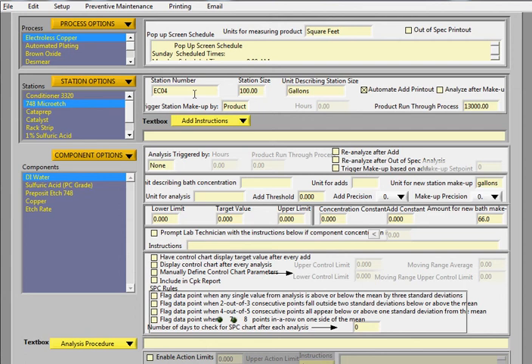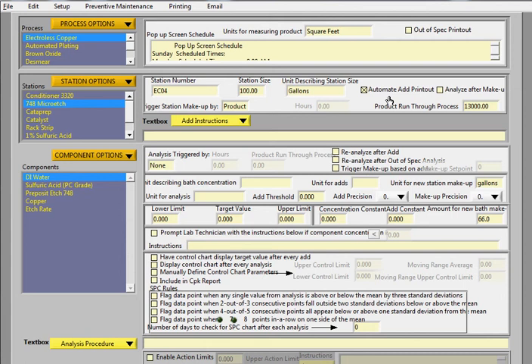In the station area, you can enter in a station name or number, the station size, and then the units of size. In this case, it's 100 gallons. And you can actually automate and add printout. So after the analysis, it automatically prints out.